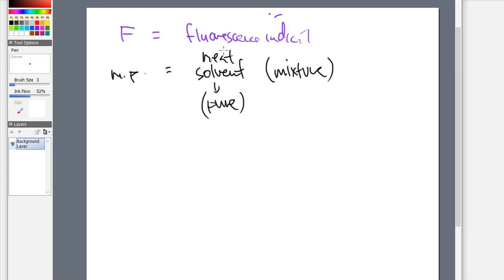Next up is a mixture. Mixtures are also pretty common, but these mixtures, I'm going to say, have around 2 components, but nothing really more. And I'm going to put approximately 2. There are chances that I will see 3, but very often we try to keep this simple, and we want 2 solvents if we're going to mix it. We don't even like to have 3. If we need 3, we can do them, whatever. But 3 is kind of pushing it. We don't really desperately want anything more than 3 at all. It just overly complicates the developing and how that is taking place. So that is a mobile phase term that we can use, neat solvents versus mixtures.